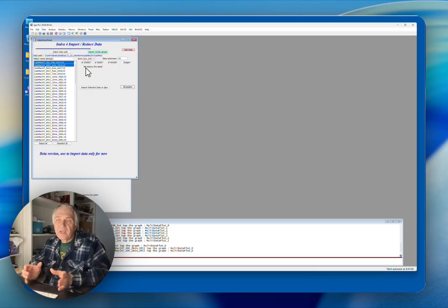That's mostly okay for practically anyone, except for people who have monodispersed systems or something with diffraction peaks or more complicated structures, in which case the number of points can be rebinned manually or can be changed in Igor later on, because you can go all the way up to 8,000 points or 7,000 points or so. But that has not been implemented as an option in the automatic routine. The automatic routine has to work without any user input.